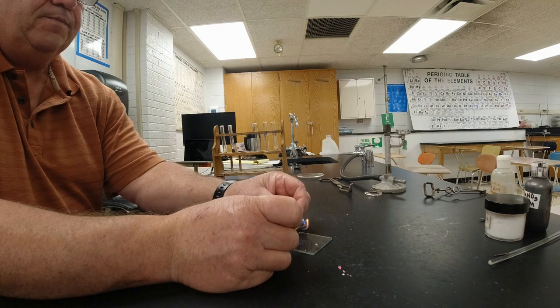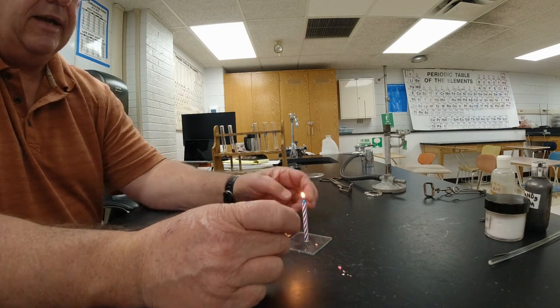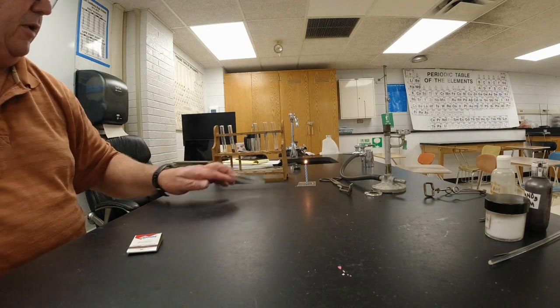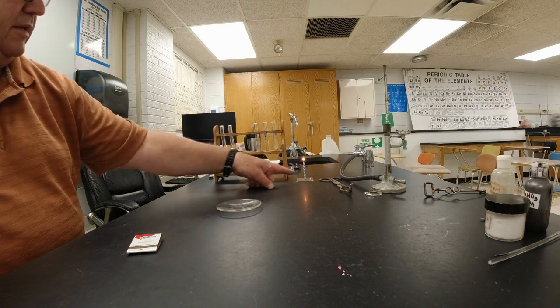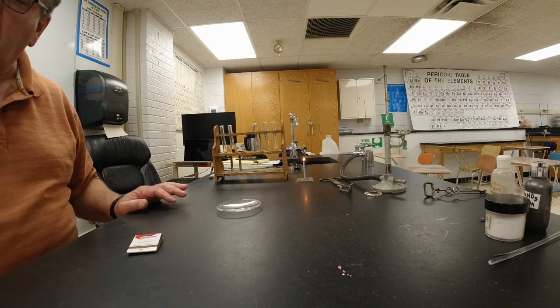Light a candle, and I'm going to melt the bottom of this so it sticks down like that, and we're just going to let this thing burn off to the side here. So up here we have our melting candle wax, and down there is our burning candle. So we're just going to leave that burn for a little while.